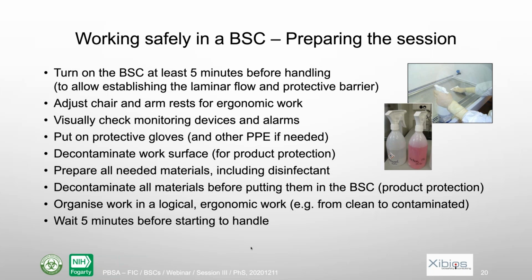Then you should decontaminate the work surfaces. That's mainly for product protection because it's before working. And prepare all the needed materials, including disinfectant inside the biosafety cabinet, including also the small waste bin that you should put inside.